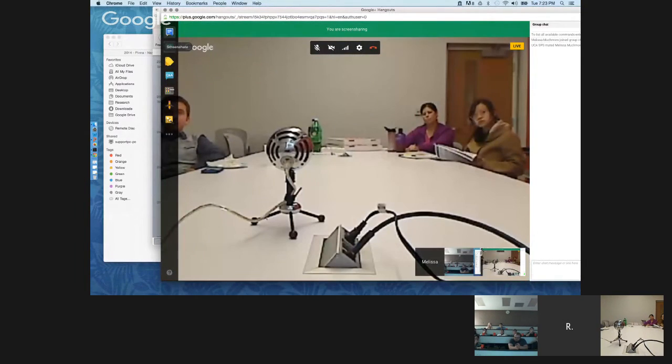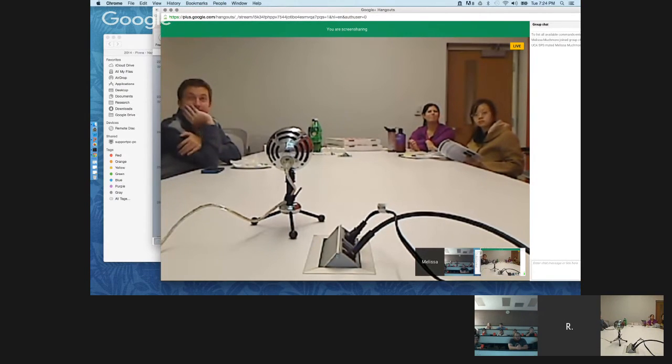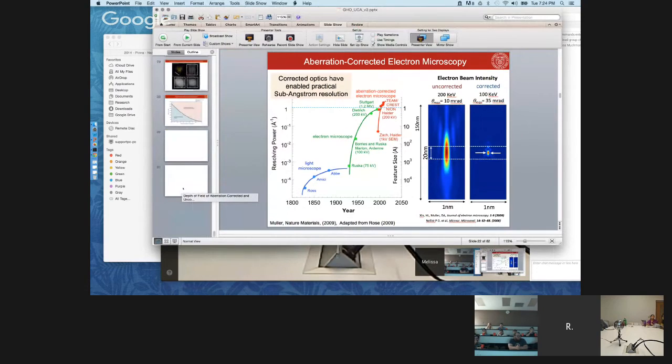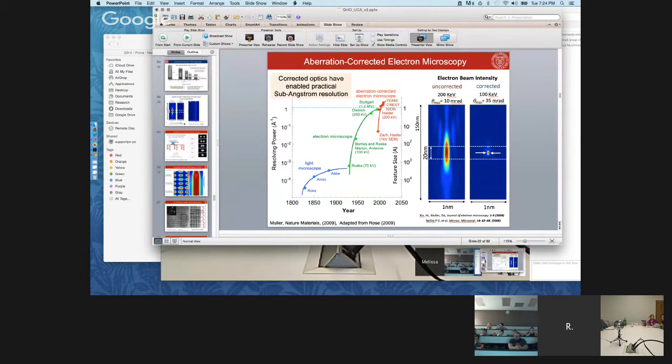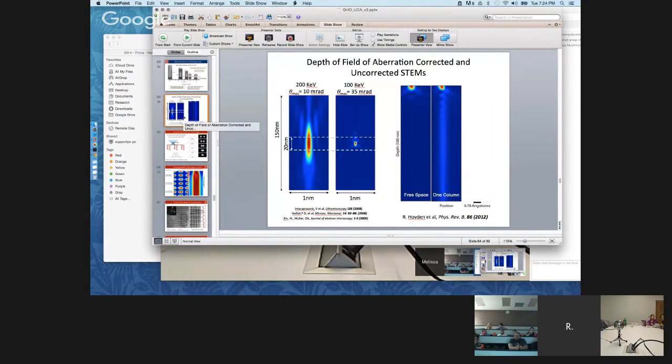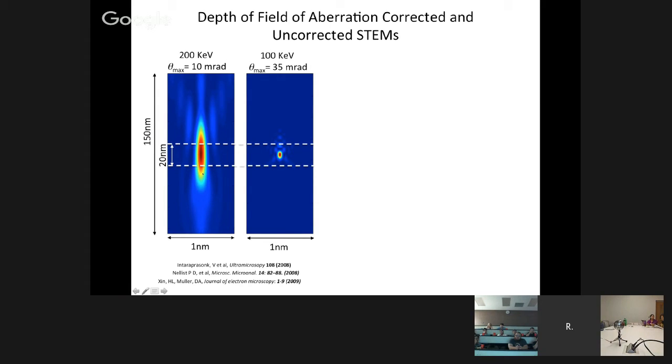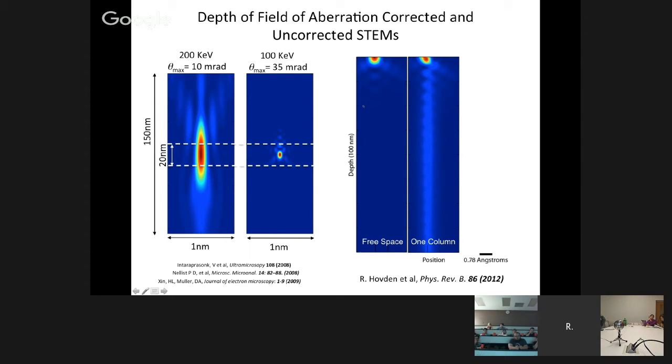Yeah, there's actually a whole other area of research that I got into during my PhD, which is channeling effects. Maybe I have a slide. Okay, here's a slide. This is a cool phenomenon that happens. You can see the full screen right now? Yes. Right, so these are the same profiles of the wave function of this focused electron beam. At the top is the electron beam coming in and going out.